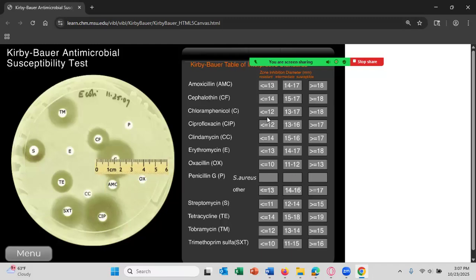And come up here. And if you get it wrong, like that, you'll see a red X through it. If you get it right, it'll be green. So go ahead and do that. And you need to go through this to answer some of the questions in the worksheet. And then what you want to do, let's see, put that down. Oops, didn't mean to do that. Is click the menu again.